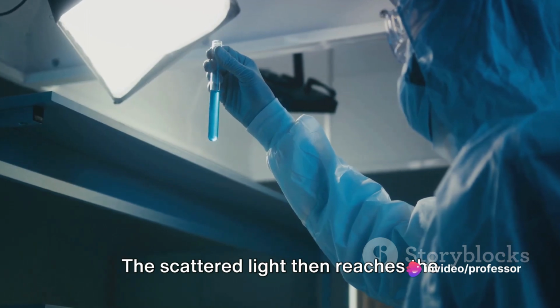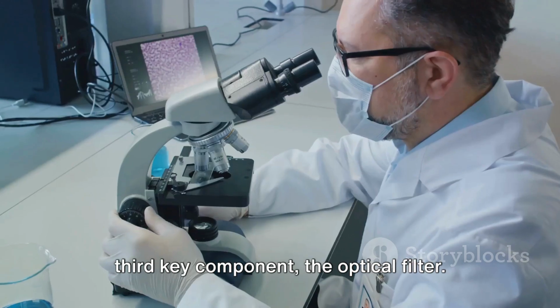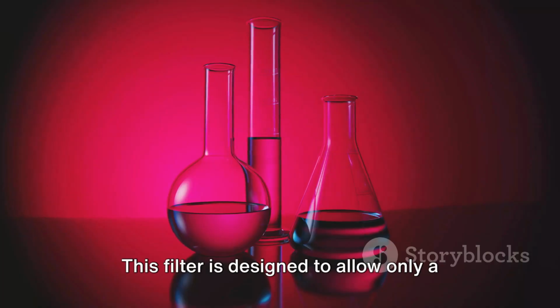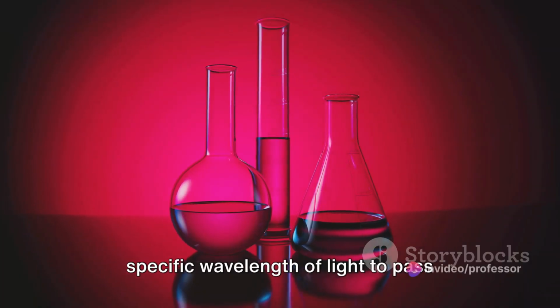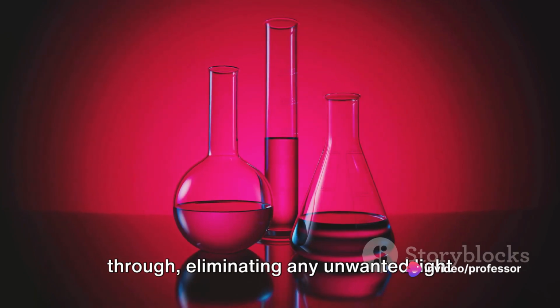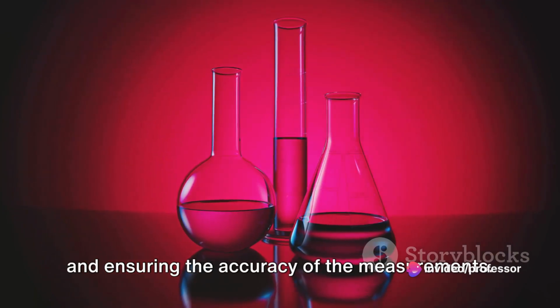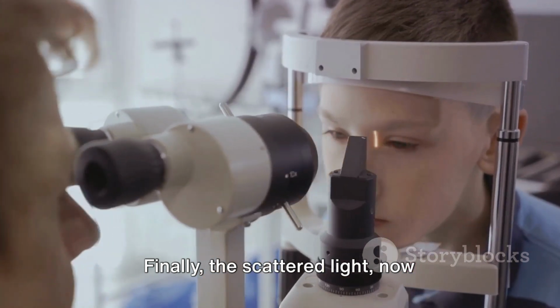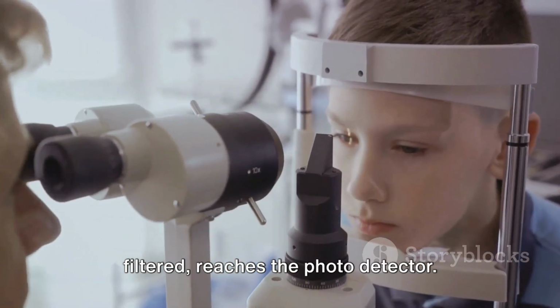The scattered light then reaches the third key component, the optical filter. This filter is designed to allow only a specific wavelength of light to pass through, eliminating any unwanted light and ensuring the accuracy of the measurements. Finally, the scattered light, now filtered, reaches the photodetector.